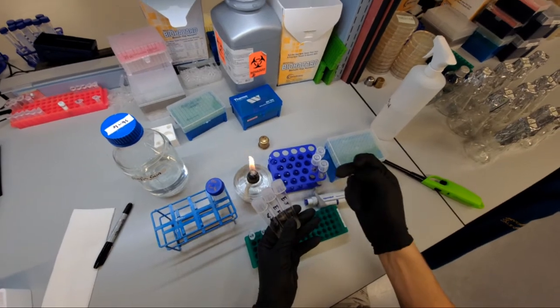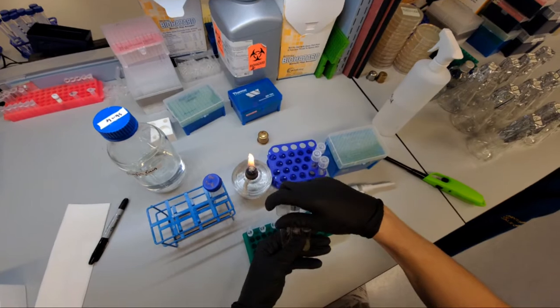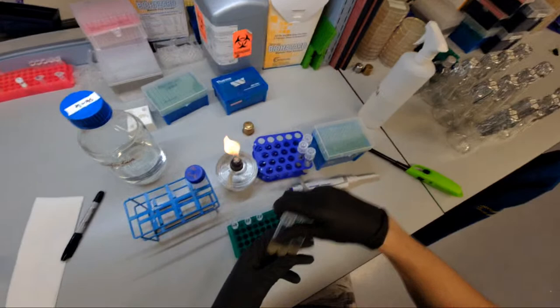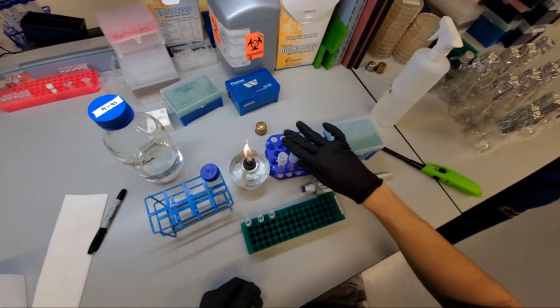So this is the EF strain. It's got two genes knocked out. The EJ strain has the E and the J gene knocked out. And these genes should increase growth in acetate which is basically neutralized vinegar. But again, these were grown in rich media.